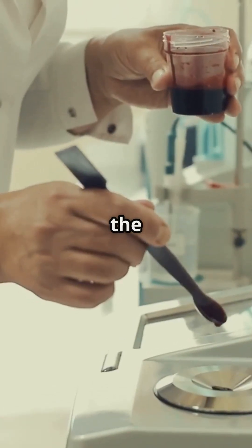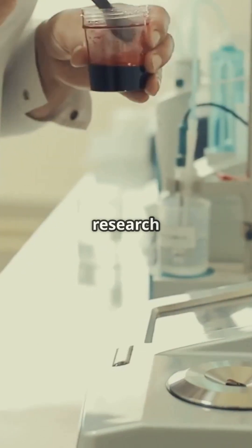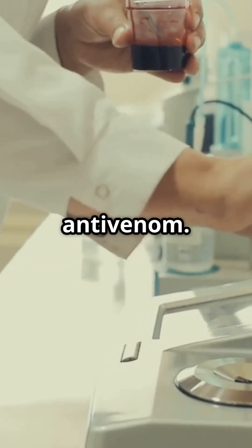In this video, we'll discover the amazing process of extracting snake venom, which is used in research and to make anti-venom.